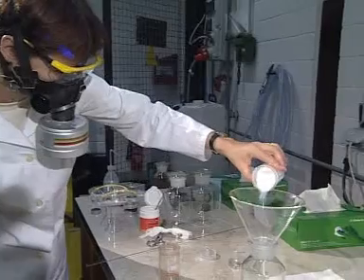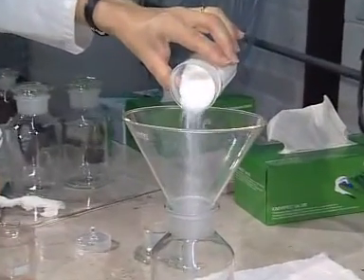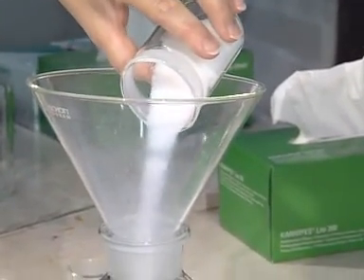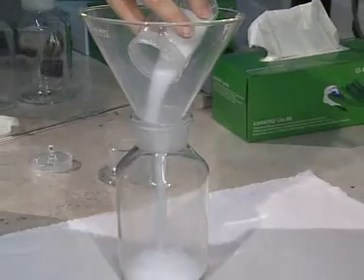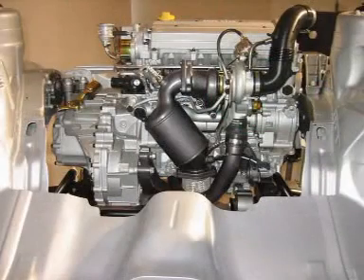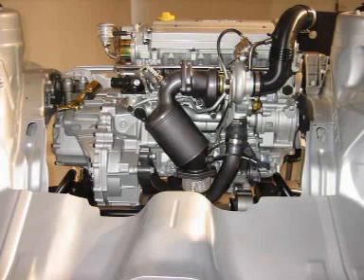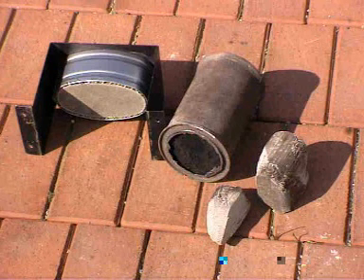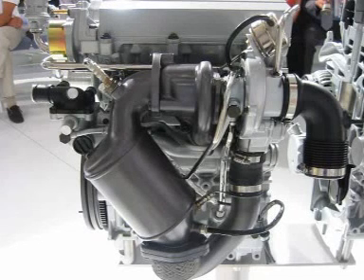X-ray absorption spectroscopy is used to characterize nanocrystalline and amorphous materials for the production of new functional materials. Heterogeneous catalysts are such functional materials, for they consist of very fine metal particles applied to a carrier material. If the effectiveness or stability of a catalyst is to be improved by analytical techniques, this requires information about the electronic and geometric structures of the metal particles.